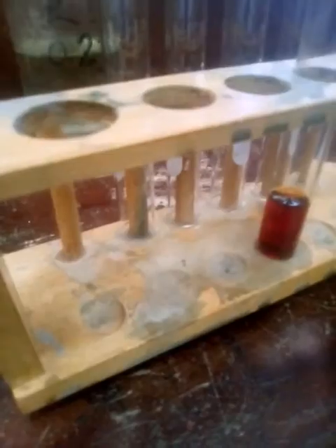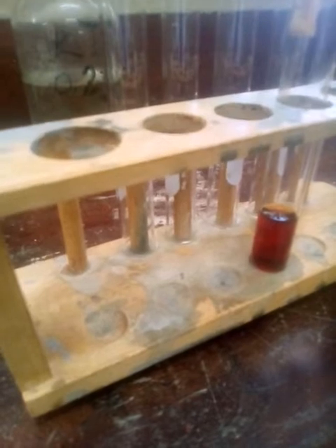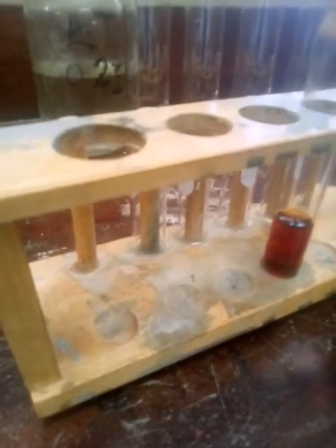I'm just looking to see if we are seeing any effervescence, bubbles. A little bit of effervescence was seen at the start of the reaction. However, we are now going to test to see if we can identify at least one product of this reaction.